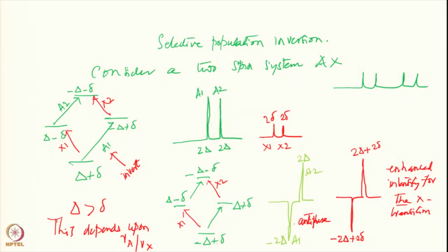So, the important thing to notice here is that you may call this a disadvantage, while there is an advantage which we already discussed. The disadvantages would be, first, you have positive and negative signals.